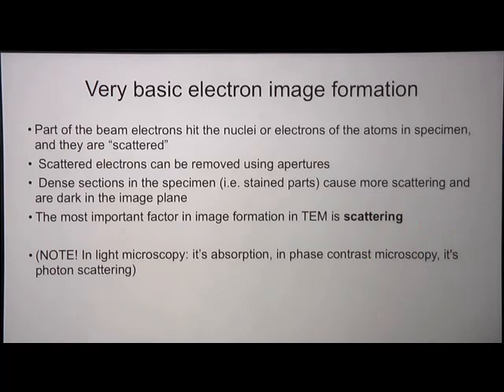And this is in contrast to some forms of light microscopy where we talk mostly about absorption and re-emission, right? So in electron microscopes, the fundamental process is electron scattering with the sample. Okay.